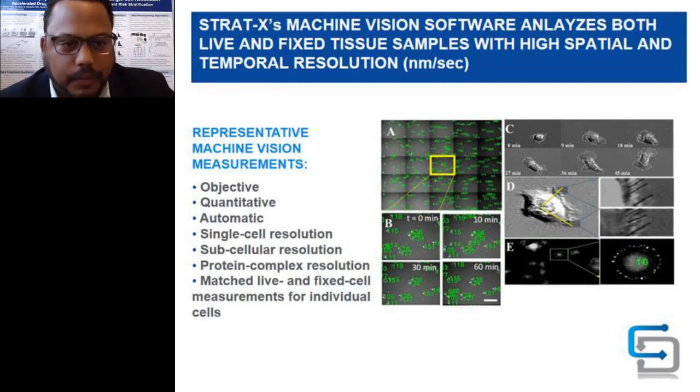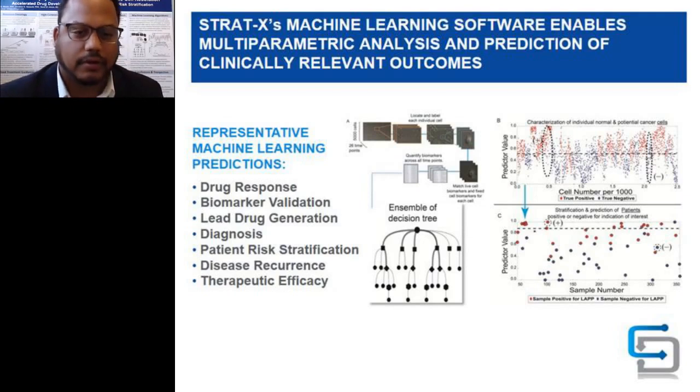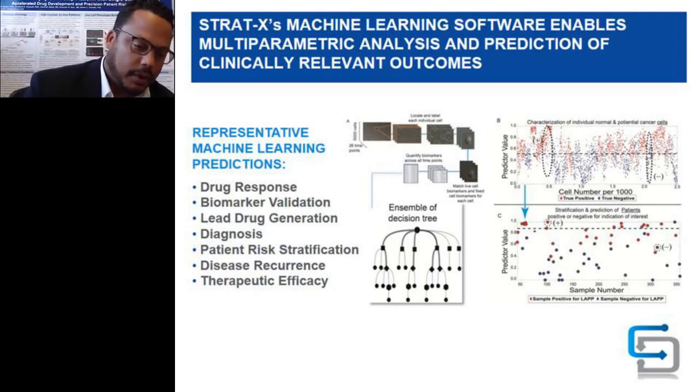So once we are able to actually employ machine learning, then a whole new world, if you will, opens up. We can take live cells, we can choose which biomarkers are of interest to us, given a vast suite of, again, multi-omic biomarkers.